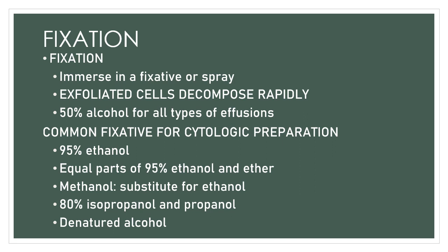Then you have your fixation of your cells, of your smears, of course. You immerse them in a fixative or spray. Immediate fixation is needed because your exfoliated cells decompose rapidly.